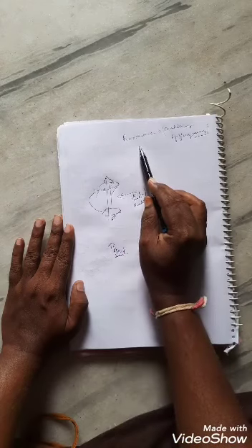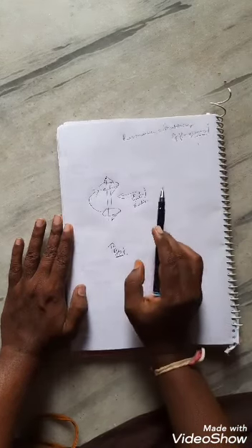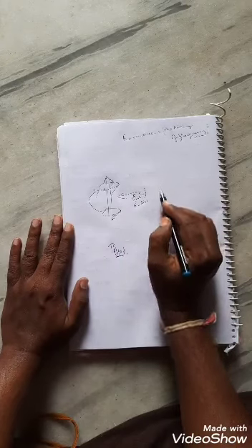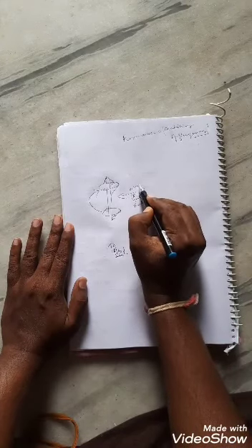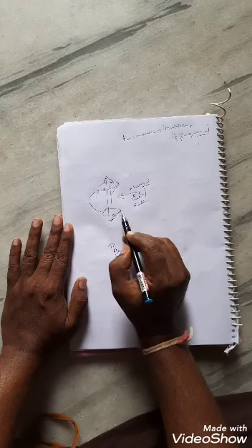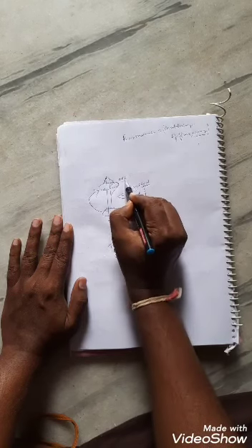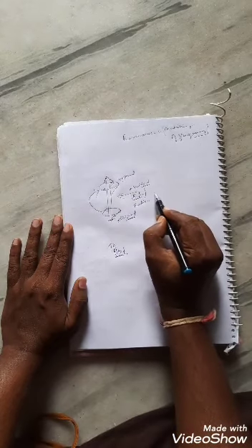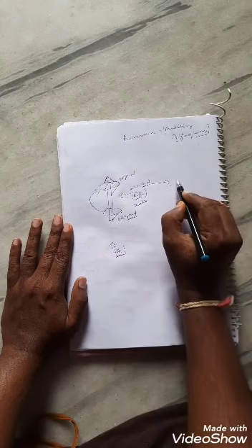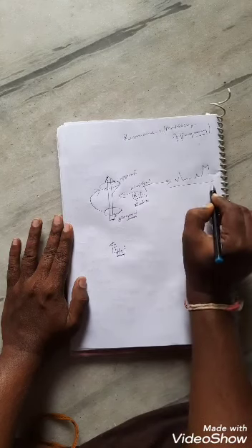So in the quantum approach and in the classical approach, in both cases resonance is the condition, and the computer will take the energy absorbed by this spinning top or magnet to flip from the aligned level to the opposite level, and eventually this absorbed energy is read by the computer or NMR meter, and you will get a graph accordingly like this, right.